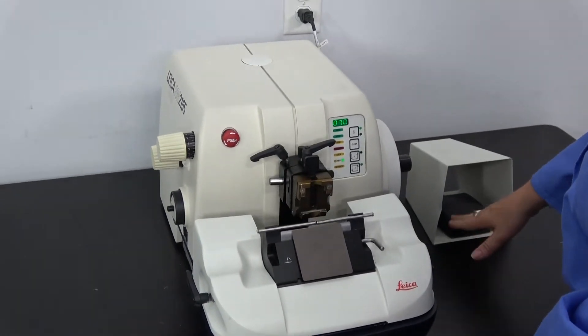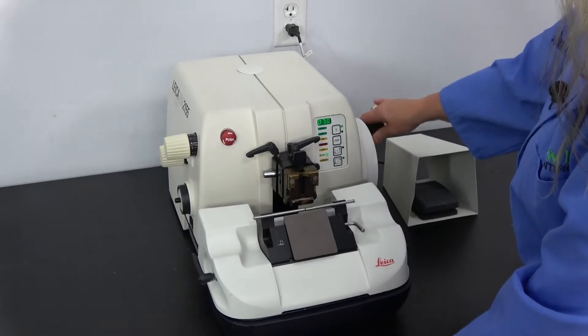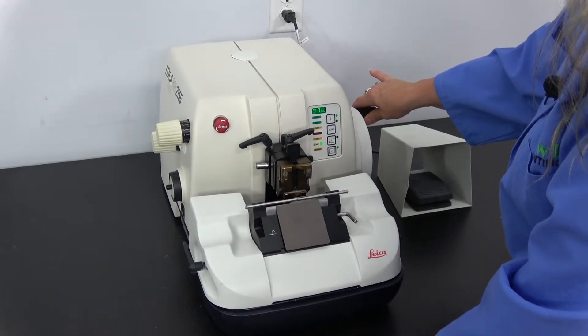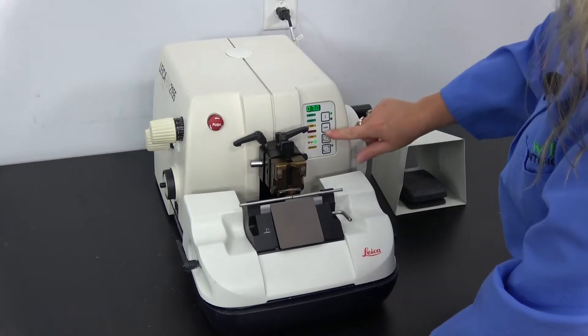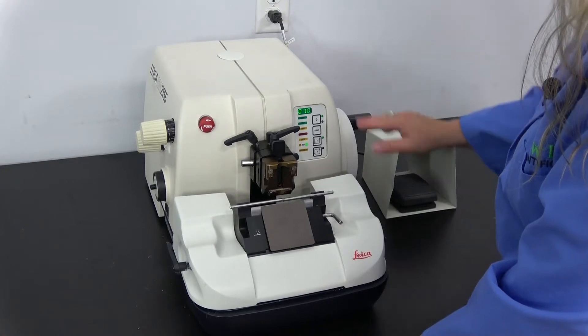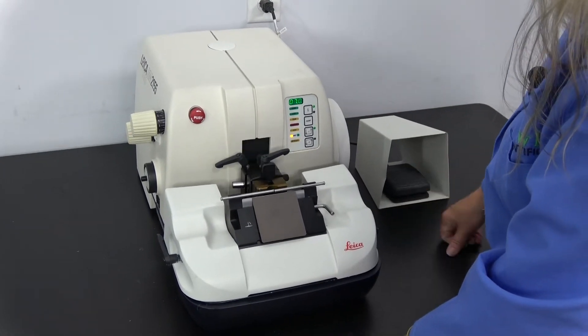We can stop this unit. You can move the handle back here if you want to run off a couple of manuals. You set it for one at a time and you give the pedal a light push — it will only do one slice at a time.